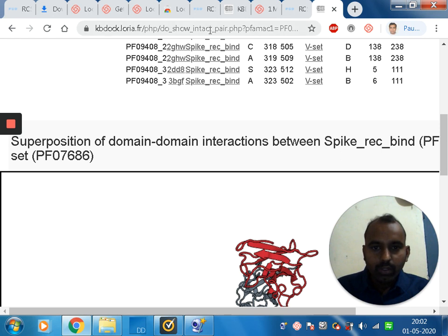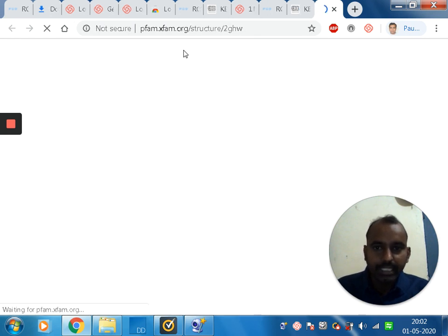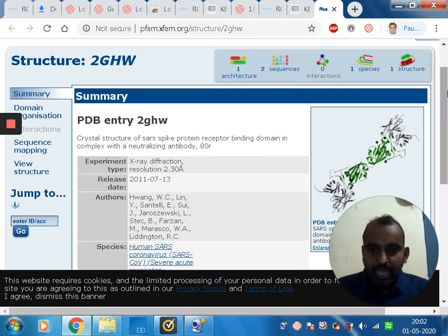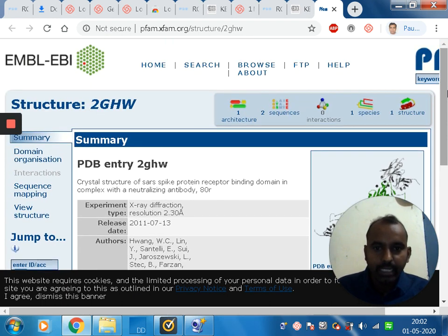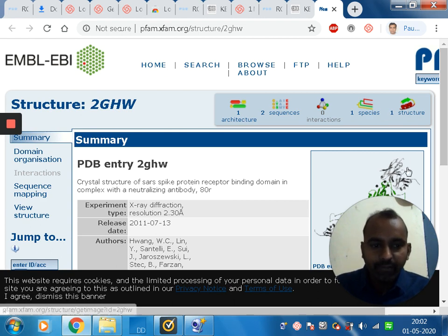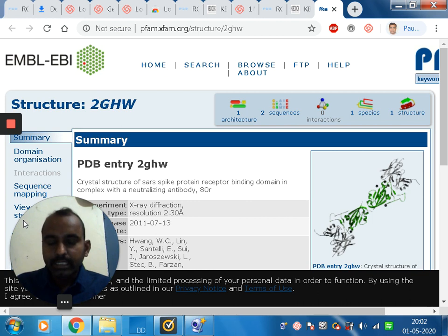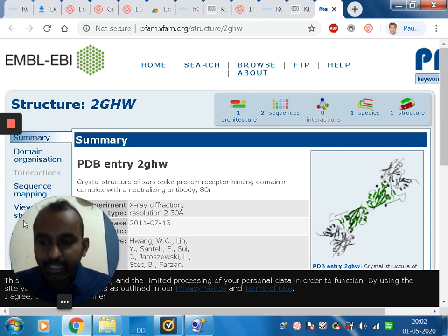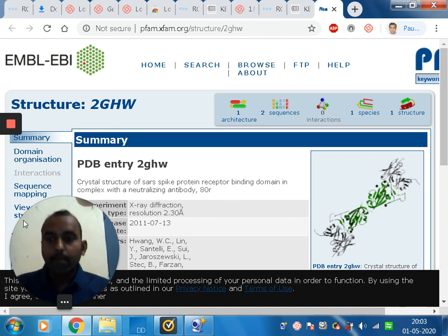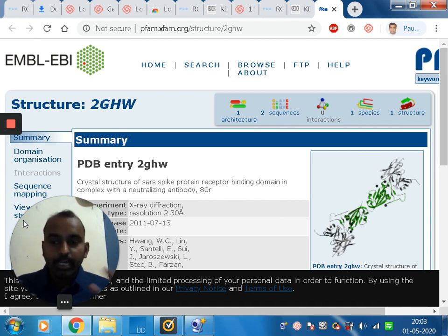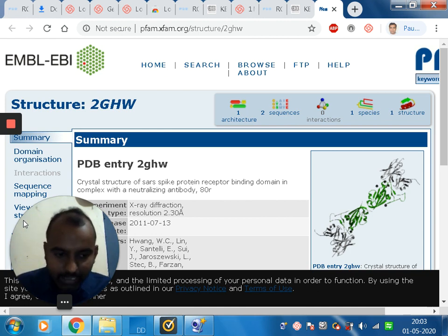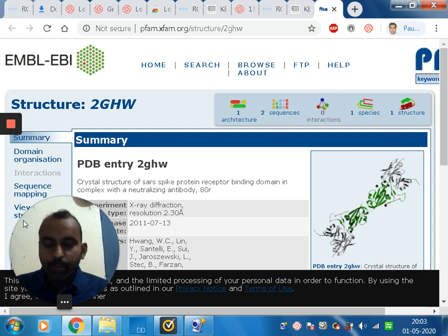Looking at the other heavy chain and light chain data — this is the Pfam structural data — it shows the SARS protein binding domain in complex with neutralizing antibodies. This fundamental information shows that the existing SARS coronavirus antibody candidate could be a vaccine for the novel coronavirus, which originated from it. By this we are explaining protein-protein docking of two proteins that interact and exhibit binding interactions.